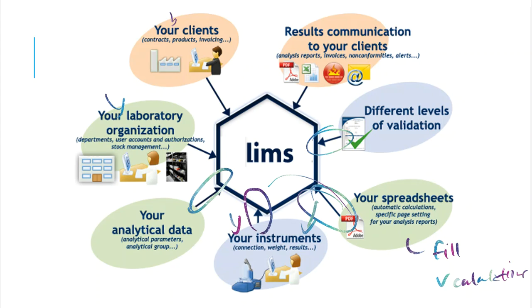Next up here is that the clients, which are the people that have hired the laboratory to do a certain job, those clients pay that company to do tests for them, right? And clients can log into the LIMS system, and in real time, they can track what is getting done. So if they've submitted a laboratory sample, then someone from the outside can go into the LIMS with a username and password, and they can view all of the test results that are getting generated in real time, and they can keep track and be like, hey, listen, there's this one test and it's just kind of been out there and it's not completed and it's been out there for 2 weeks. What's going on with it, right? So they can call this company up and say, you know, lab, you got to get it together a little bit because you're slacking with your employees. And then they can follow up on those tests and make sure that they get completed.